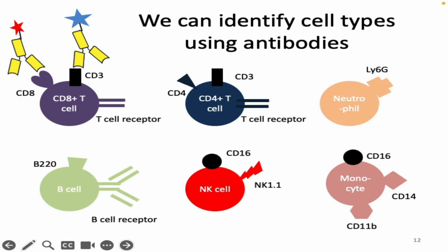So that's all cool. This is a big part of what we're doing, but there's still one other piece to this. Because you might still look at this and be like, awesome, Dr. Barker. Now we're going to look at these under a microscope, and instead of looking for the things we were looking for before, look for blues and reds. Do you think that is going to speed you up very much compared to what you did before? No. So it's a way you can get more information about the cells. Yay. But it's not going to help you with your speed problem.